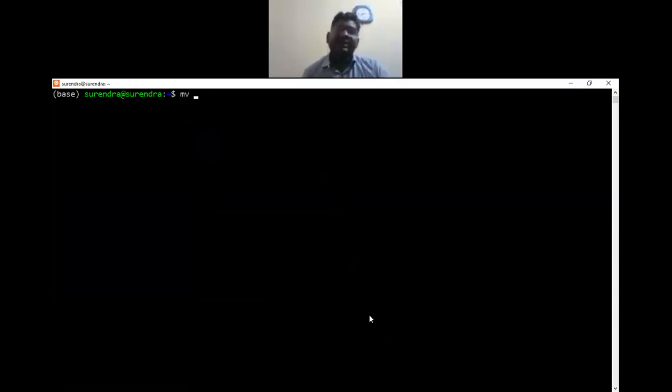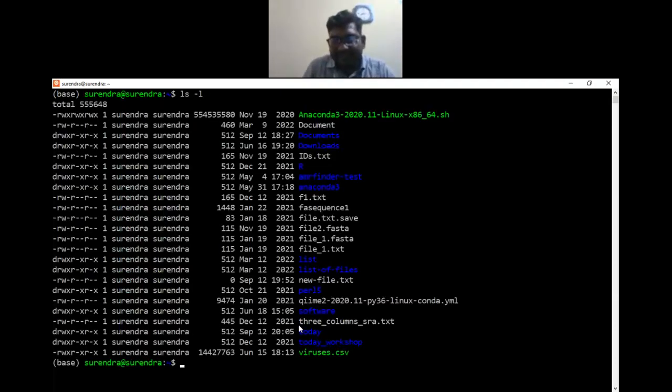mv command is for the rename. So you can use the mv command here. Suppose you have this file here, 3 column sra.txt. You want to rename this file. So what you can do here, mv, move, is for the move and can also be used to rename the files. So let's first see how we can rename the file.